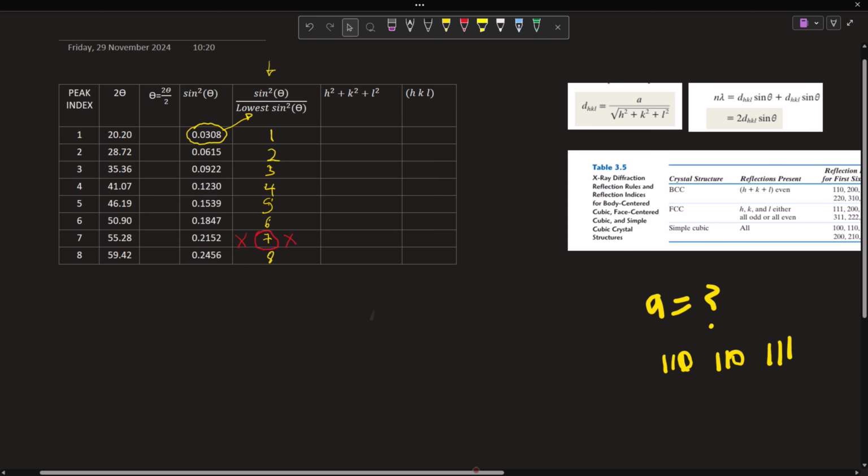The moment you see 7, what you want to do is multiply all your figures by another figure. So for this one, since I have numbers that are whole, I can go ahead and multiply by 2. There are cases where you have to multiply by 3. There are cases where you have to multiply by 3 point something. But because my number here is whole, if the numbers here were like 2.8, 2 point this, now if I multiply by 2, I'll still be having decimal points.